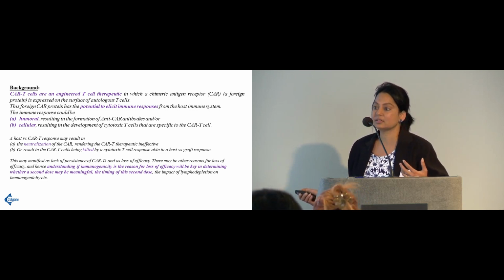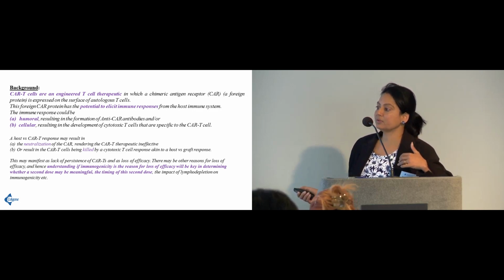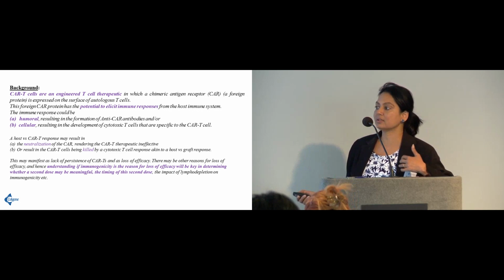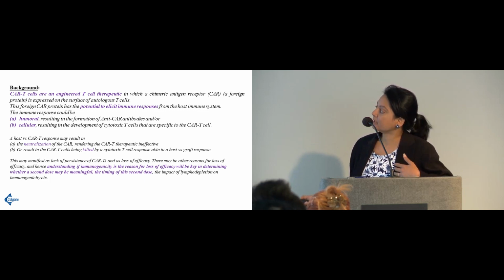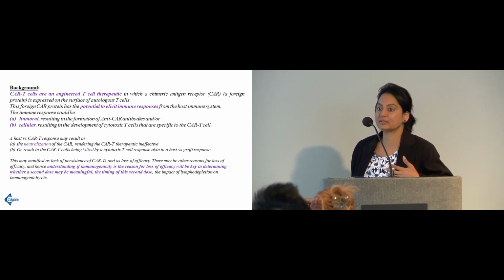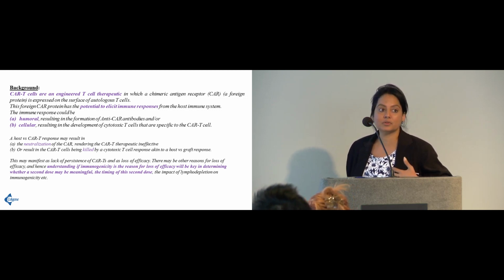As we measure it in patient samples over time, that tells us that we still have integrated vector-containing T cells, but those T cells may or may not be active T cells. They are there, physically present. So if a T cell is neutralized by a humoral response, we'll still measure it in the VCN assay because it still exists in circulation. Whereas in the cytotoxic case, you will actually see the T cell numbers going down.